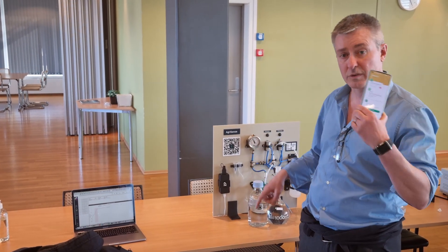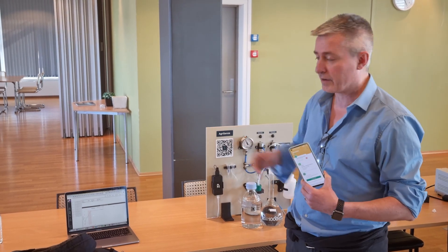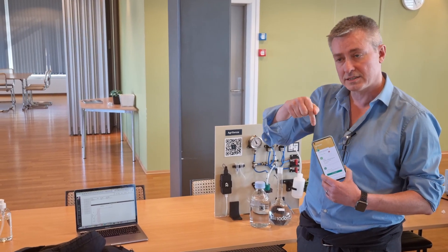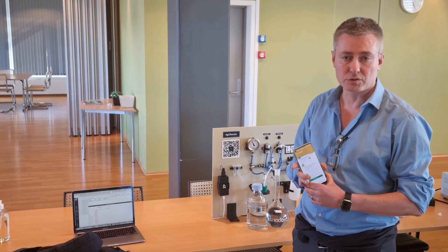We've got the electronics, we have Bluetooth connectivity to that, and we have a cloud system so we get local data and the data is currently stored in the cloud as well.